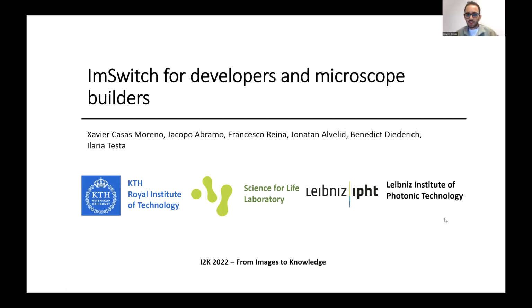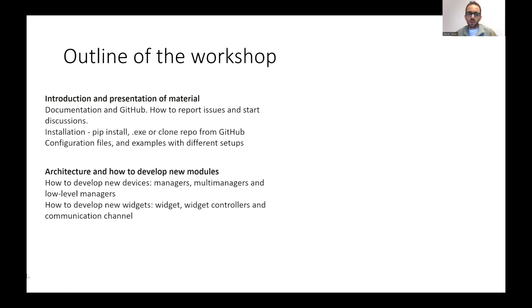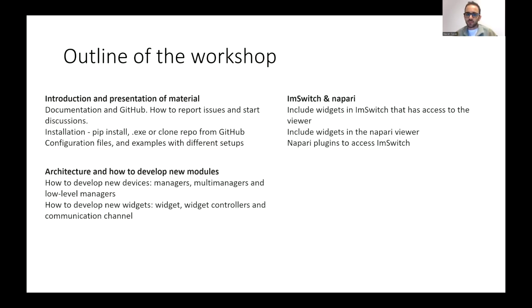So we divided the workshop in different sections. First of all, I will go through the introduction and presentation of material, including GitHub, the read the docs page, and the paper, installation and the configuration files. Then I will explain the architecture of ImSwitch and how to develop different modules, including those for supporting more devices, but also those related to graphical interface components.